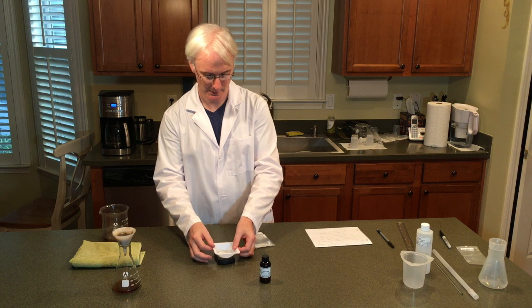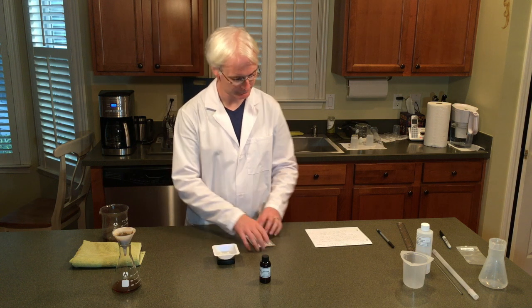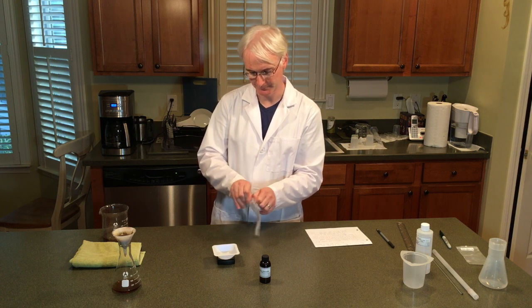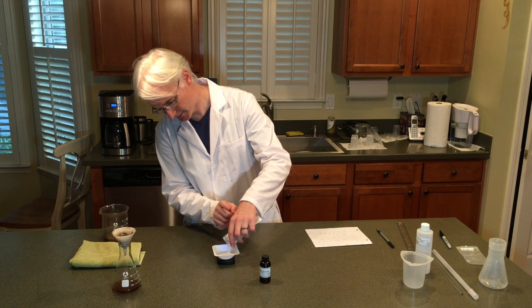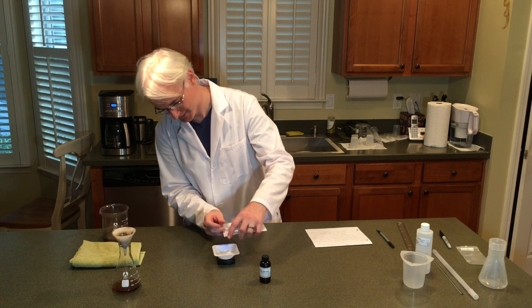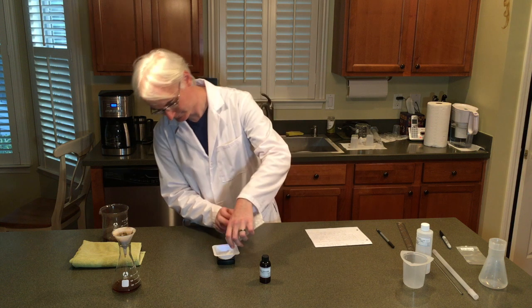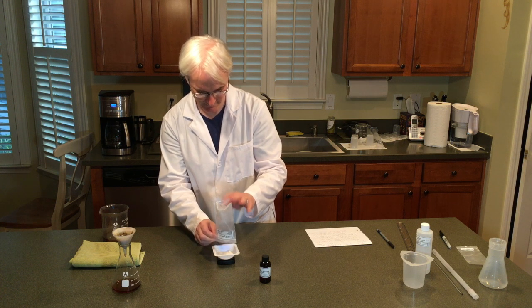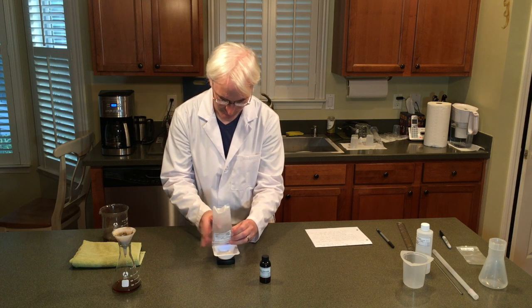We need a weigh boat. Turn on the weigh scale, place the weigh boat on, and zero the scale. We're going to weigh in 3 grams of cream of tartar. It says there are 3 grams in the packet — I've come across some where they've been off by about 20%, but this looks close. I've got 2.6 at the moment... 2.9... and there we go, 3.0.